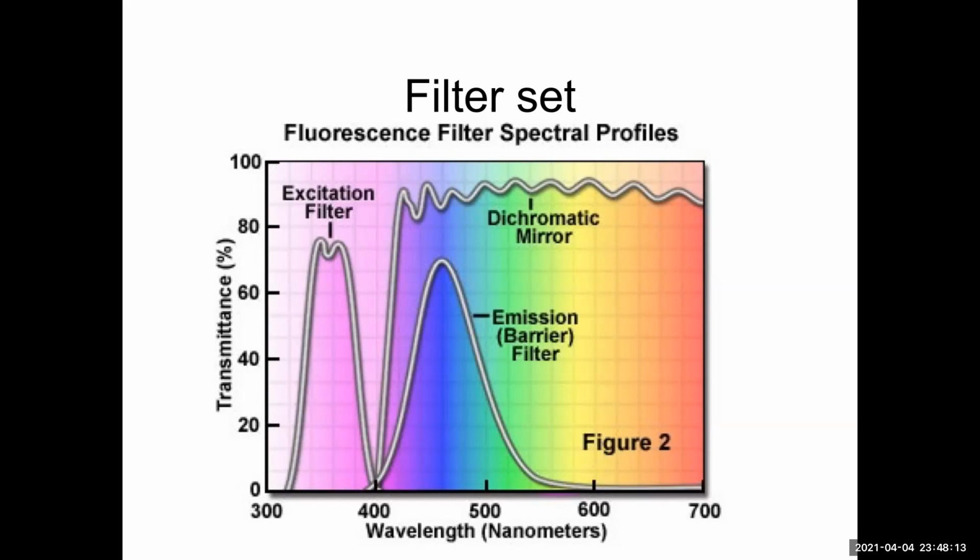And if you're trying to do quantitation, which is absolutely possible, you're trying to say, how much do I have? How much of that particular protein or virus or bacteria do I have in this sample? Then we get into some really important quality control around knowing what your scope is, knowing what your filter sets or filter cubes are, knowing the metadata from how you acquired it, knowing the specs of your camera.